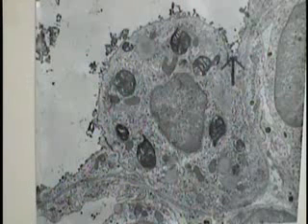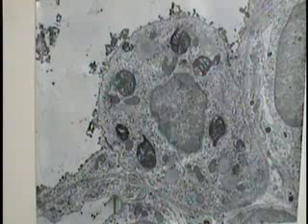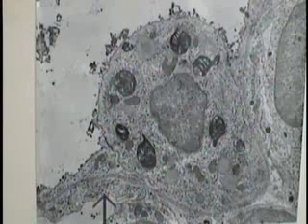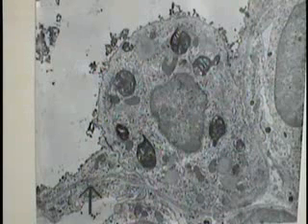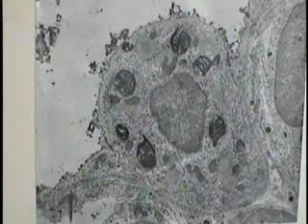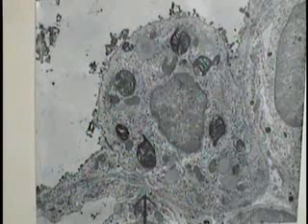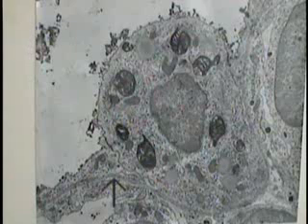It also shares a junction here with another type 1 cell going in the direction illustrated by the arrow. The lumen of a capillary is shown and is being crossed by the arrow at this point. If one looks at the interface between the endothelial cytoplasm and the epithelial cytoplasm here, one can envision two fused basement membranes coming from each cell type, and it courses around that type 2 cell, which lies upon it.